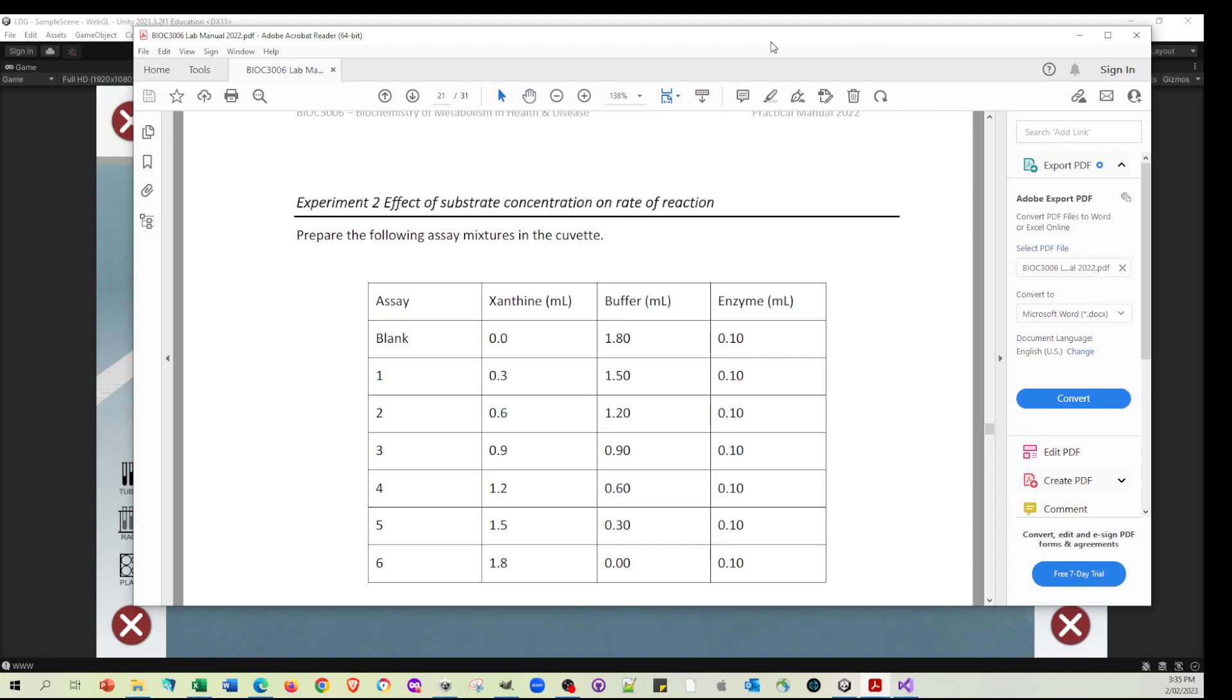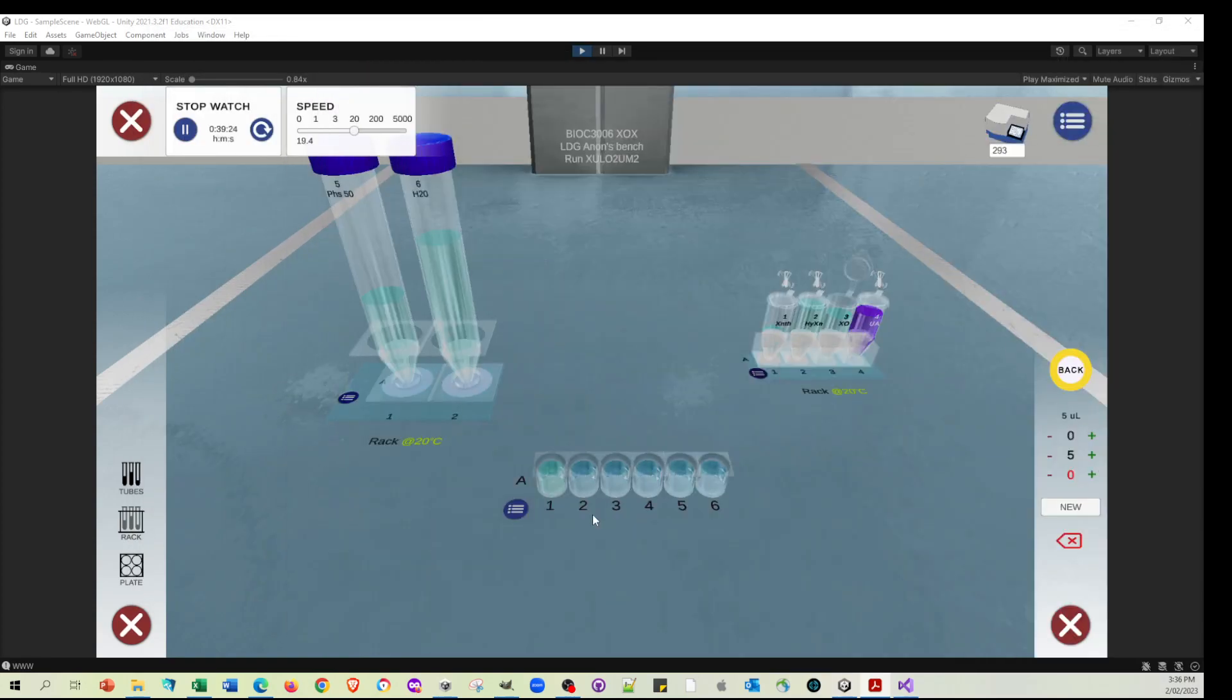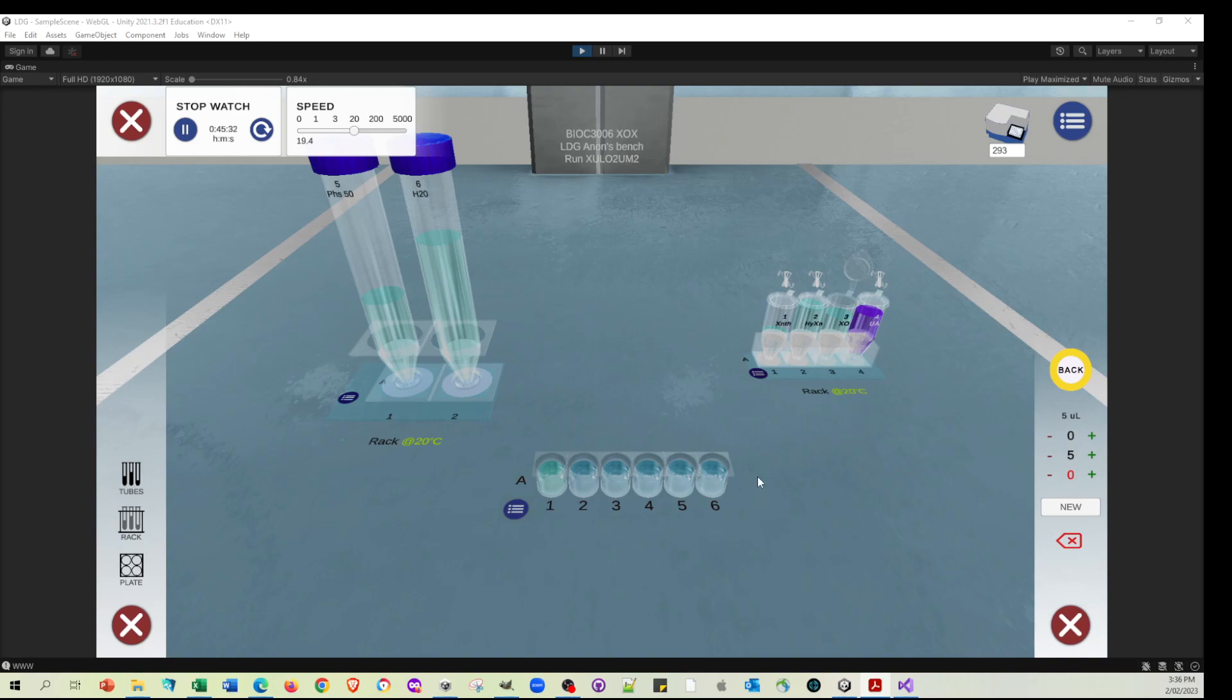Obviously, I would set that up the same way. 30 microliters, 150 microliters, 10 microliters. I know that if I do that, I'll get a faster rate in these ones here. They won't run out so quickly either. So everything looks really nice and very quick. As you can see, the whole of that practical could just take 10 minutes for all three experiments, really, because with the speed dilator we'd be going for 44 minutes in pretend time. So a lot of things that we can do there.